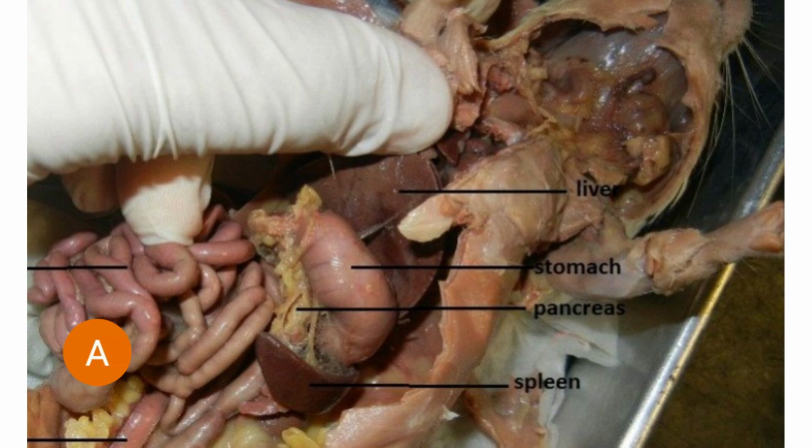So the spleen is going to be this darker maroon colored organ underneath the pancreas, and the pancreas is going to be on the back side of the stomach. So it is labeled here, that spleen. It is going to be touching the small intestines there.